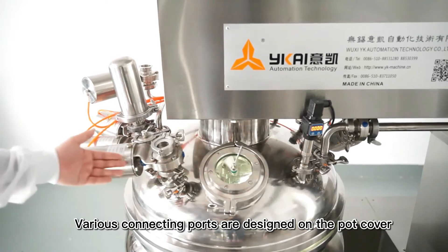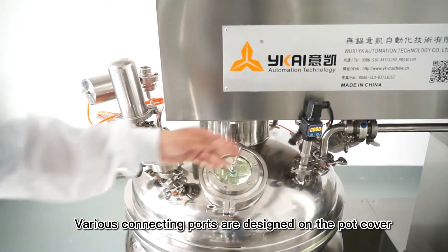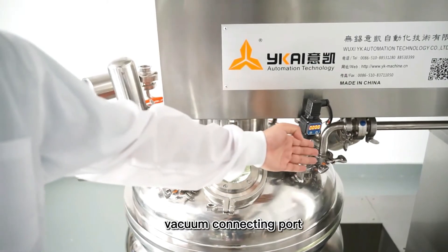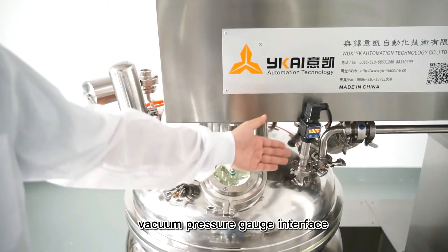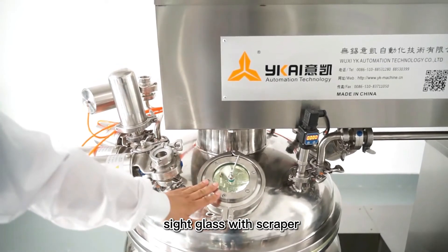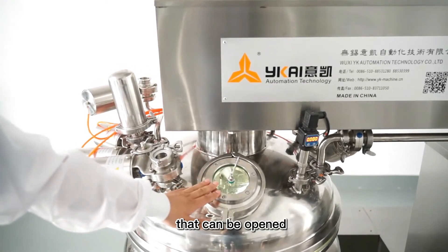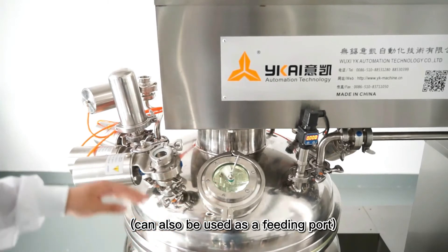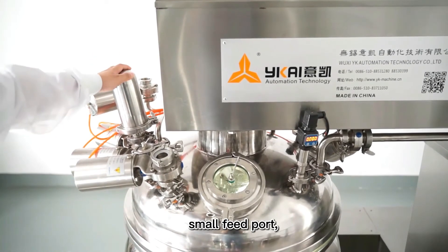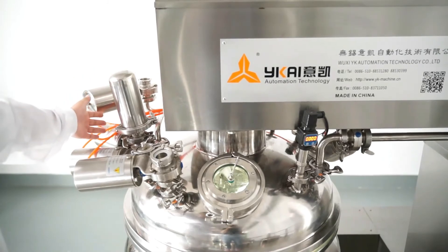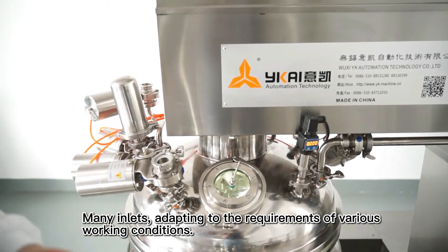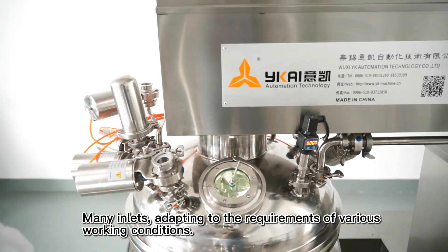Various connecting ports are designed on the pot cover, including the light connecting port, vacuum connecting port, vacuum pressure gauge interface, side glass with scraper that can be opened and can also be used as a feeding port, another feed inlet, small feed port, air filter, and CIP port. Many inlets adapting to the requirements of various working conditions.